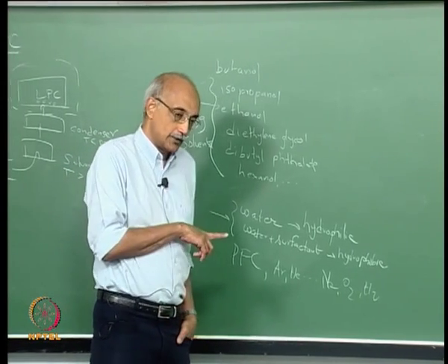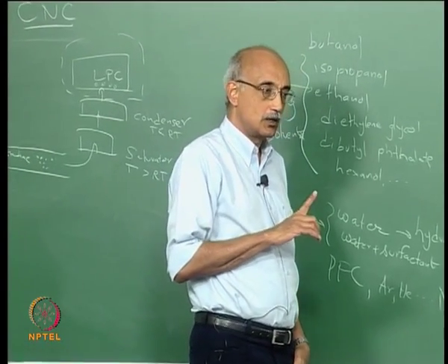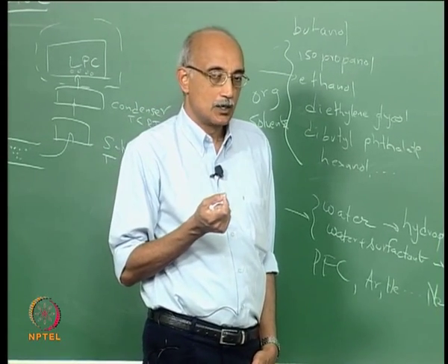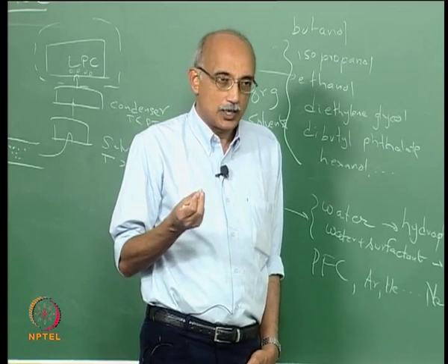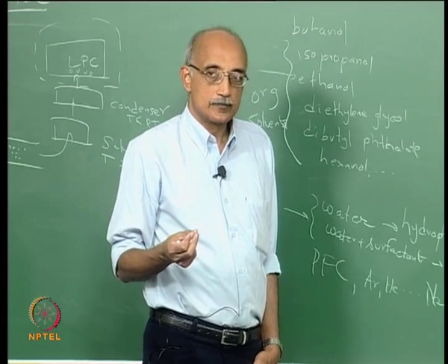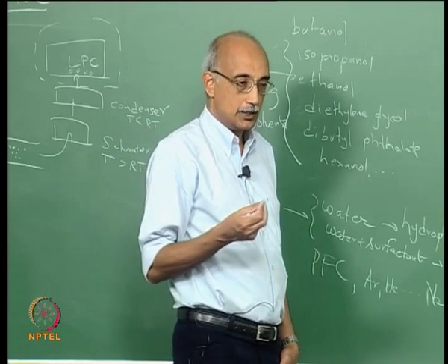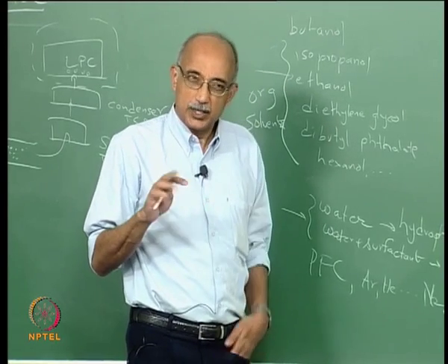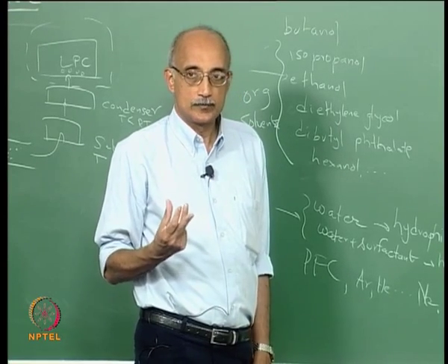Now, this method that we have been discussing so far, the condensation nuclei counter method, really works for fine droplets or ultrafine materials in air and other gases. How about if they are in a liquid? Can you still use this technique? It is actually not possible to use a condensation nuclei counting technique for particles that are suspended in liquids. So, the alternative is essentially to measure the fine particle level using quantitative methods, typically gravimetric methods that estimate total non-volatile residue in the liquid.